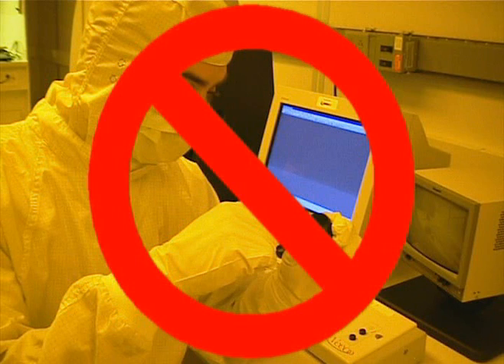The PSI calibration sample is an optical flat. It is extremely important to be careful with the flat and prevent the sample from getting scratched.